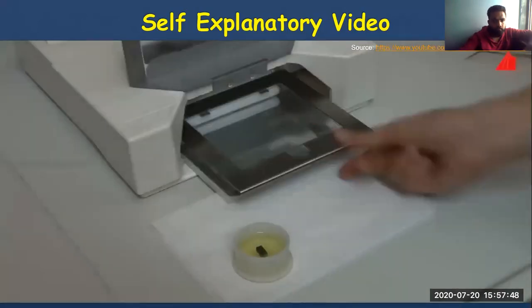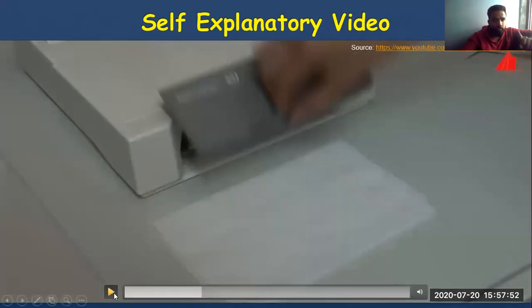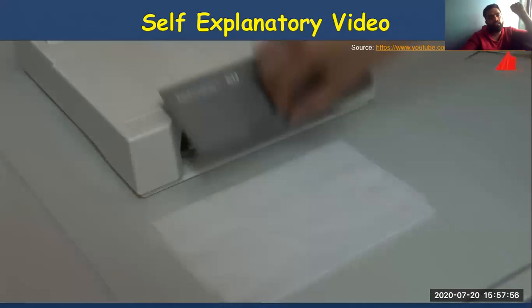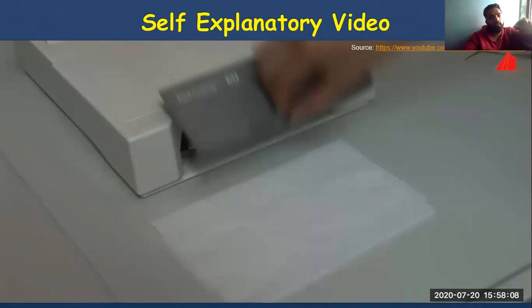Now the mold containing the specimen goes into the light curing unit. Instead of using this light curing unit, what we use in our college is hardener, because if you put it under the resin, it won't get hardened. So they use a light curing system to get it hardened. We use hardener because we have to do it without this light curing machine.